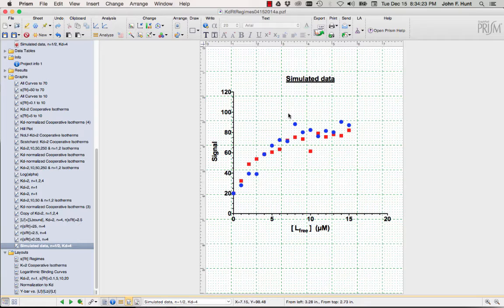The nonlinear curve fitting can be a good way to get an estimate of the cooperativity, but it's still important to know about the Hill and Scatchard analyses, because many people will use them in journal articles. And also, when we publish data from my lab, if we are concerned about the cooperativity, we would actually beat on the experiment until we got good enough data to get a convincing either Hill or Scatchard analysis. But you'll see in a moment that nonlinear curve fitting is actually very powerful.